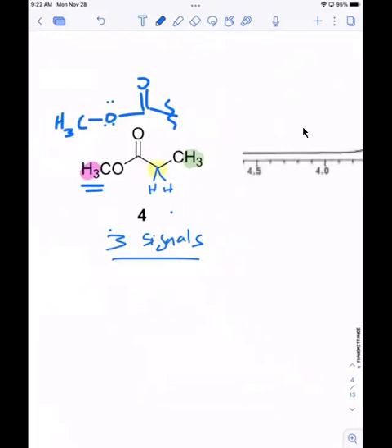On that oxygen, on the next atom over, does it have any neighbors? So you don't count it. You just count the atoms with hydrogens on them, not the oxygen. Oxygen is the neighboring atom, but it doesn't have any hydrogens on it. So yes, go ahead.